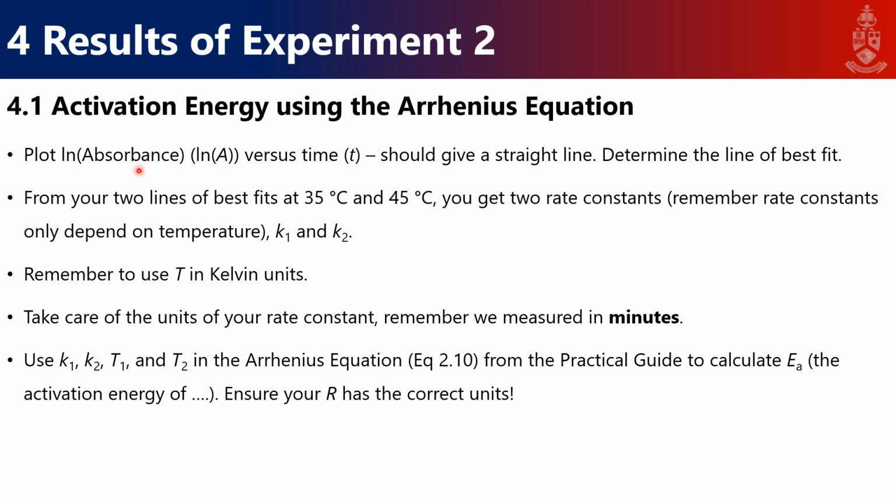Okay, so once you have all your absorbance measurements and the time intervals when you took them, so at 0, 5 minutes, 10 minutes, etc., you're going to make a plot of ln of that absorbance versus time, and that should give you a straight line. From that, you can determine a line of best fit using Excel.